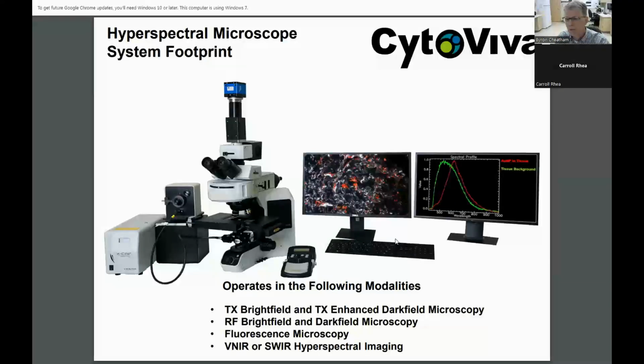Not all nanomaterials scatter light equally based on their chemistry. So different types of nanoparticles are going to scatter light differently, and so the detection limits would be different. And we can talk with each of you about questions that you might have about specific types of nanoparticles and what the detection limit might be in this technique.